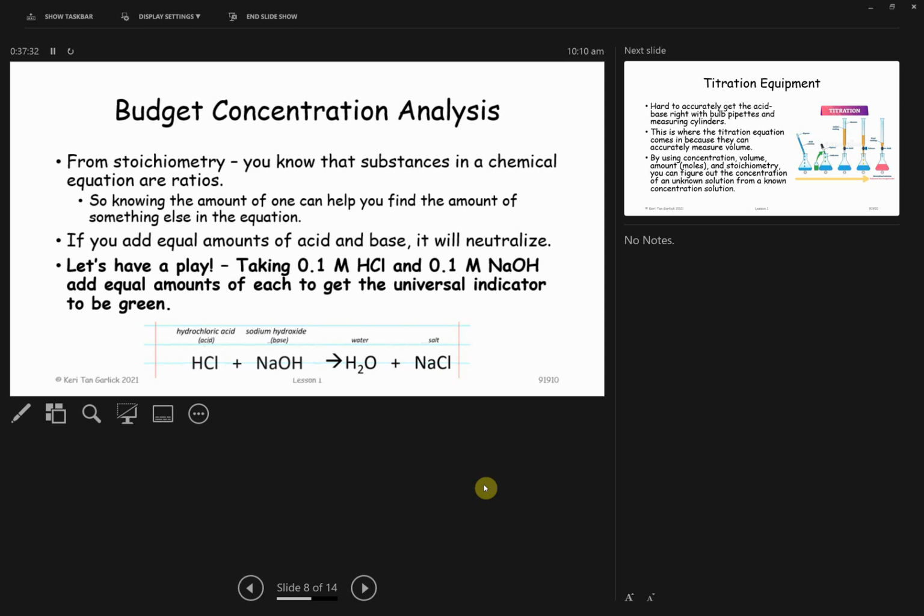All right. So here is the budget way of us doing this. Because we can't afford HPLC machines, and I don't think you'd want to be on an HPLC machine. I've broken it multiple times, and it's very terrifying to break something that's $100,000. Good news is it was easy to fix, but it's not something I think you guys want to be responsible for.